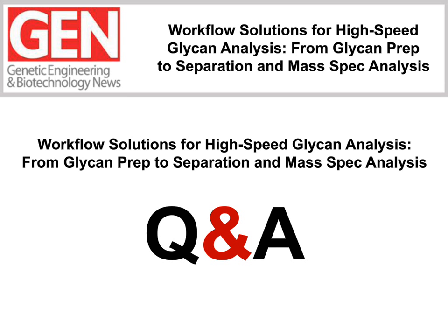Okay, Sonia, and we have another question. Why not use negative mode? This should provide better MS-MS spectra. Negative mode can be used for better structural information, but when you have 2AB labeled glycans, sometimes it cannot be sensitive enough, especially when you don't have a lot of sample.